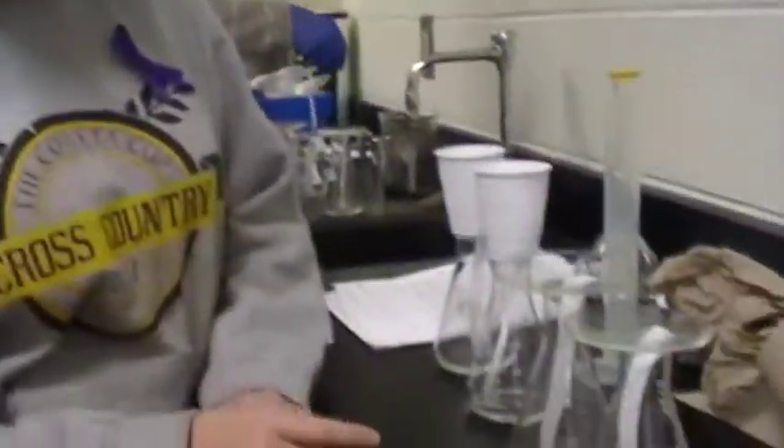Here we have several of our dyes in each of the Erlenmeyer flasks. We have Blue 2, Yellow 6, Red 40, and Green 3. If you look closely, you can see the color transforming.